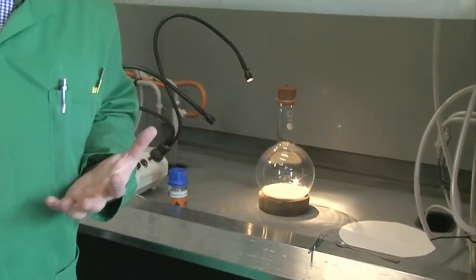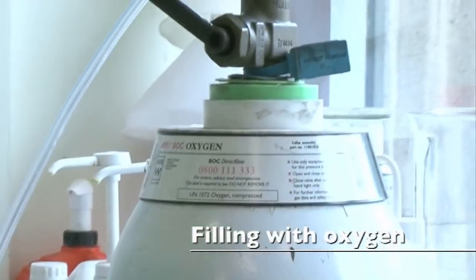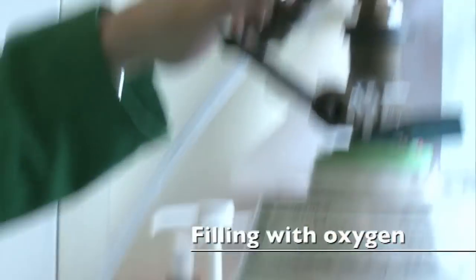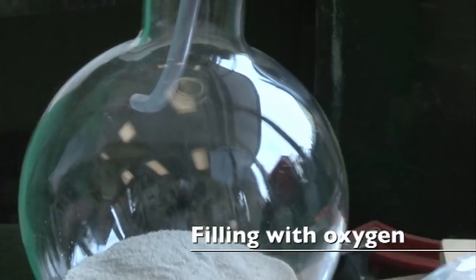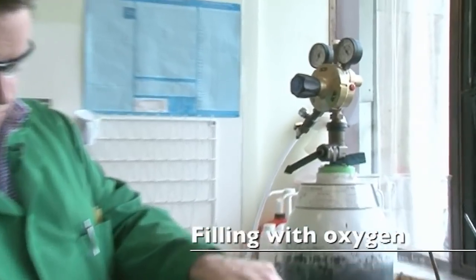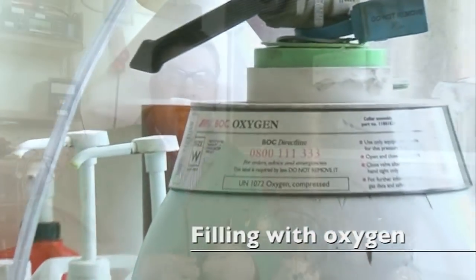So it's just a simple round bottom flask that we filled with oxygen. Now why have we filled it with oxygen? Well we've done that because we want to increase the concentration of oxygen by removing the diluent gas which is nitrogen, because nitrogen doesn't sustain combustion and will slow down the reaction.